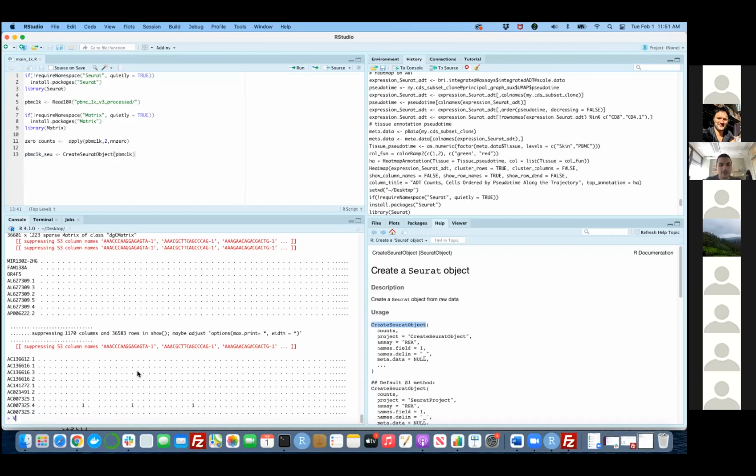To get the metadata quickly in R, you can use the View function, which lets you view any kind of table. We are going to use the metadata attached to the PBMC1K Seurat object. You can use the same notation, starting with @, but instead of choosing assays, you choose metadata.